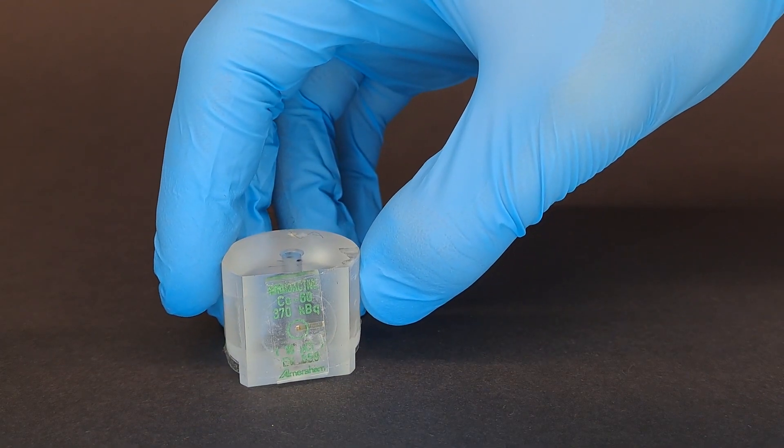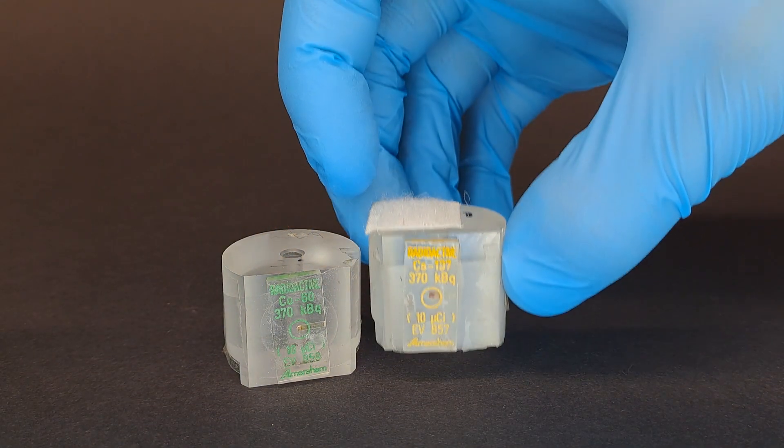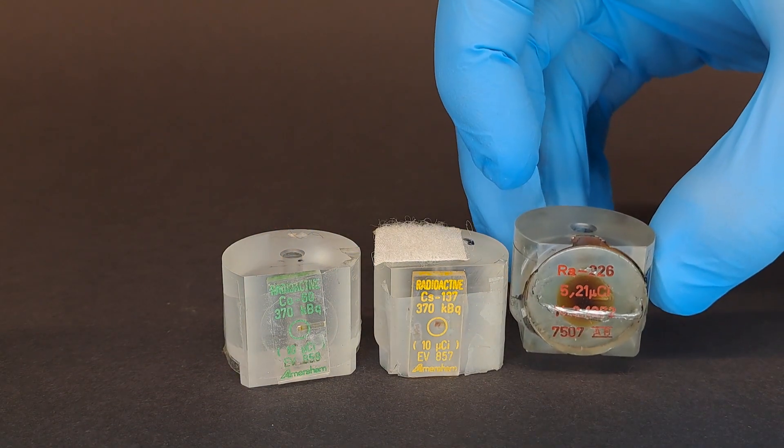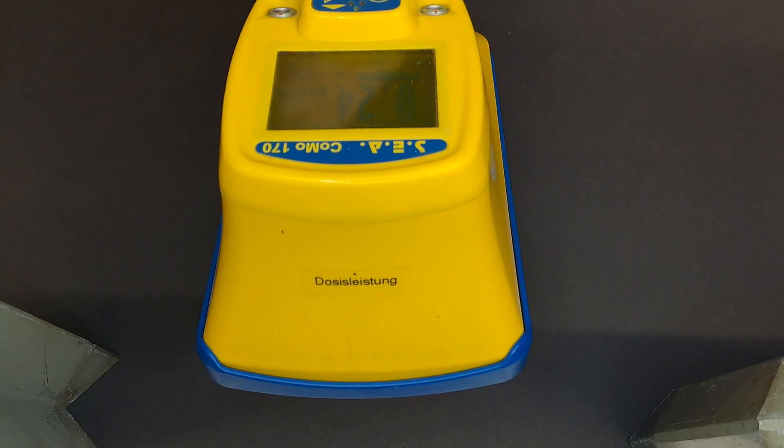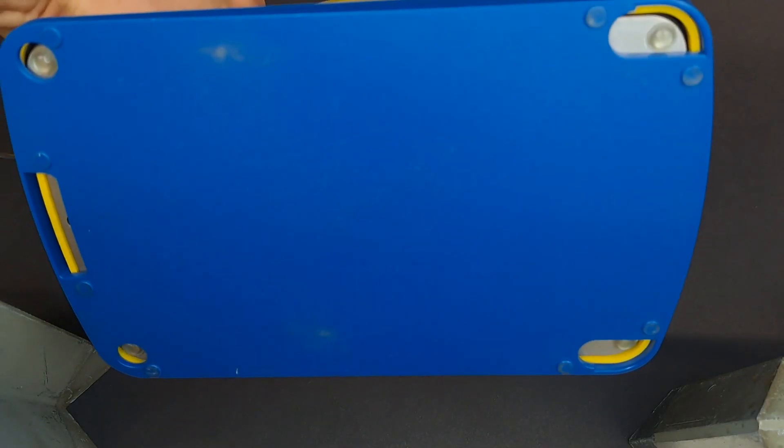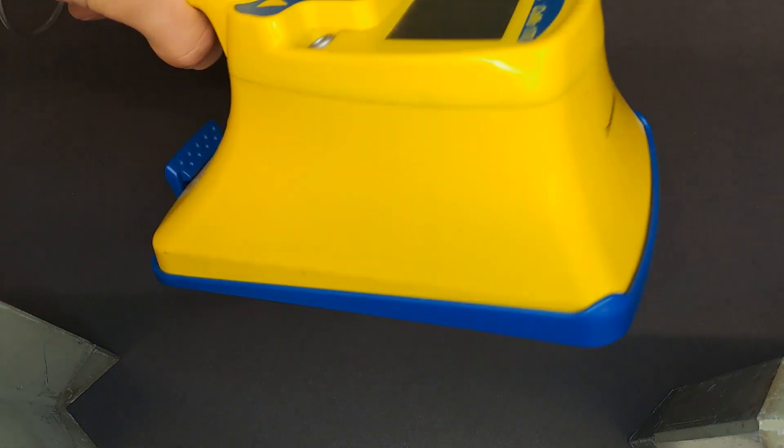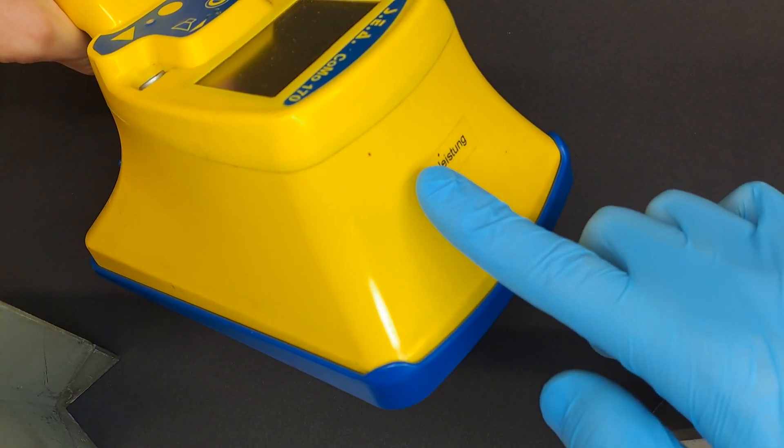Gamma calibration samples with Cobalt-60, Cesium-137, and Radium-226 are prepared. It's important to note that the professional device can measure both activity and dose rate, with the latter being measured at the front of the device.